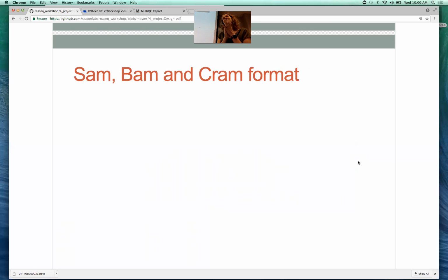So first, how many reads each lane generates, and then you divide it by the number of samples. Yes. UT Austin is great because they guarantee a minimum number of reads per lane. You can take that number and divide it by the number of libraries you're going to put on that lane to get your number of reads per library.